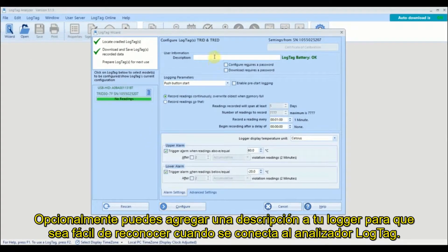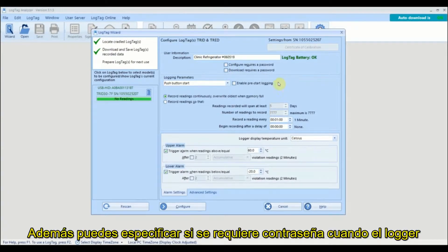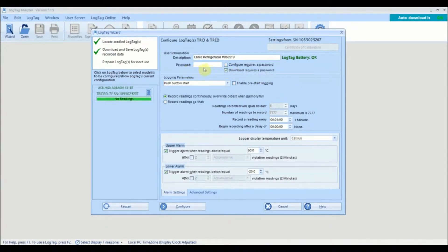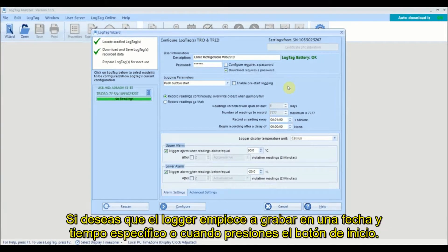Optionally, you can provide a description for your logger so it is easy to identify when the logger is next connected to LogTag Analyzer. You can also specify whether a password is required when the logger is next configured or downloaded to prevent unauthorized access. Select if you wish the logger to start recording at a specific time and date or when you push the start button.